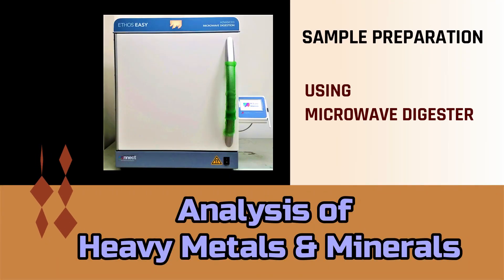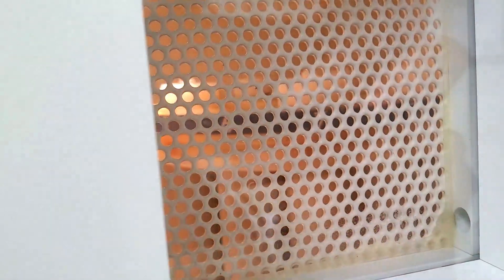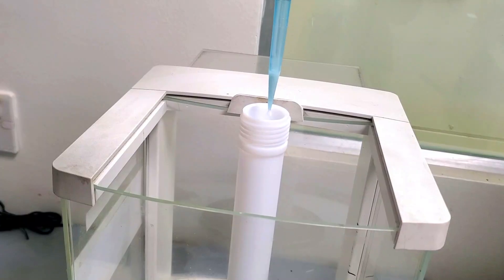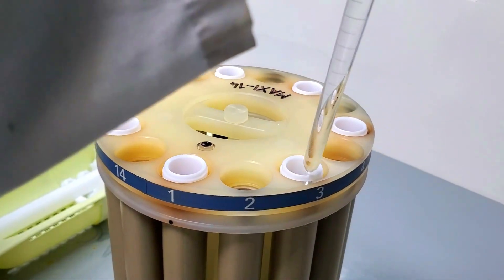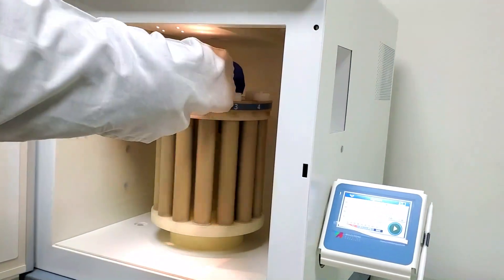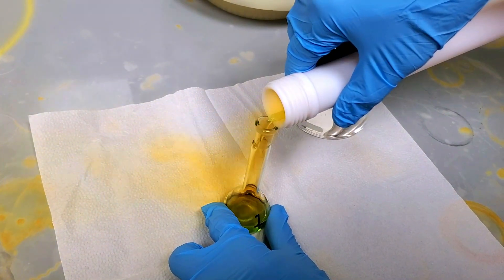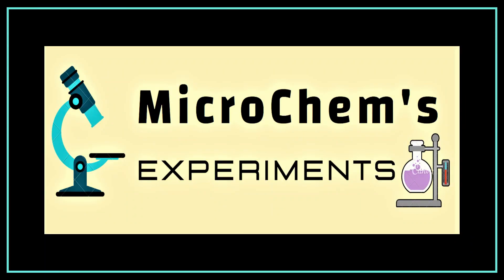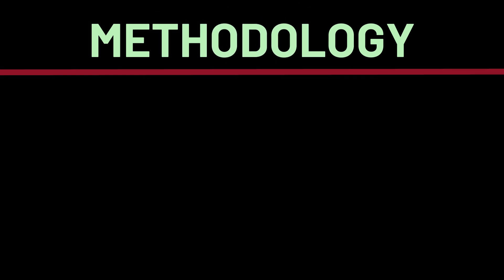To determine metals and minerals at trace levels, accurate sample preparation is critical. One of the most effective techniques for this is microwave digestion, which ensures complete breakdown of the sample matrix. In this video, we'll guide you through the detailed procedure of sample preparation using a microwave digester, tailored specifically for trace metal and mineral analysis. Welcome to Microchem's experiments — be with us, be a laboratory expert.